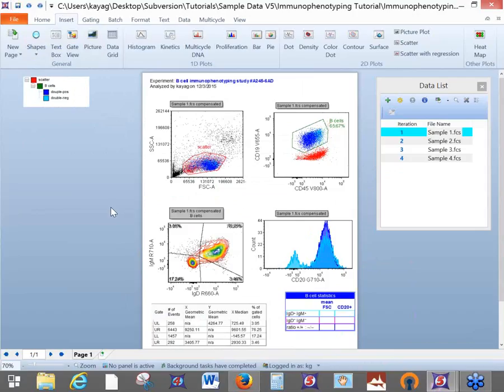But usually when you want to summarize an experiment, you want to draw in statistics from multiple plots on your layout. And I know some of you are clinical customers or research customers who are using very complex layouts, sometimes with multiple pages, 5, 10, I've even seen 50-page layouts. And so you can imagine in a layout like that, one of these gate statistics windows is not really an effective way to summarize the entire experiment. So in that case, what you want to do is insert one of these nice custom text tables, and we have one already inserted here.